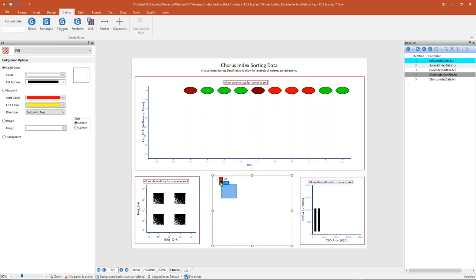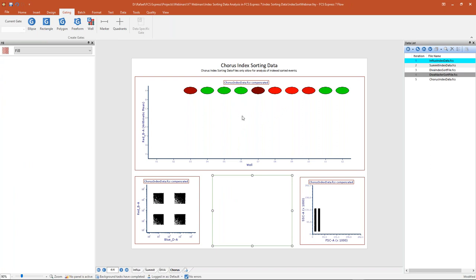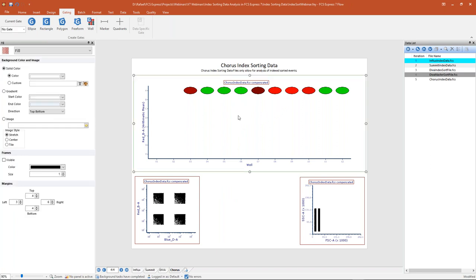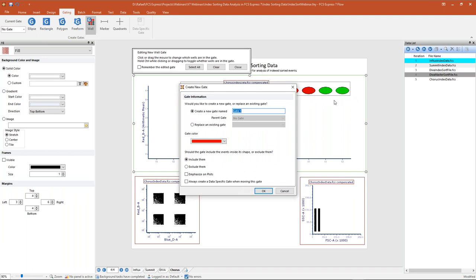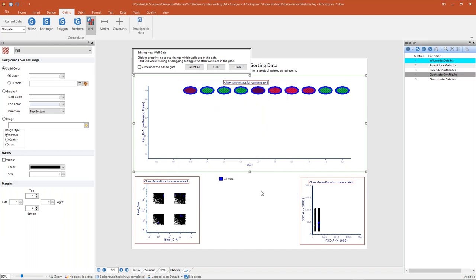To start again, we'll delete the two gates from our DIVA analysis, then create a well gate on our Chorus data. I'll create another 'all wells' gate by going to the top, selecting my well gate, drawing a large rectangle around all wells, calling this 'all wells,' changing the gate color to blue, emphasizing this on my plots, and clicking OK. You can see I've selected only those wells that have data in them, and it's back gating onto the plots below.